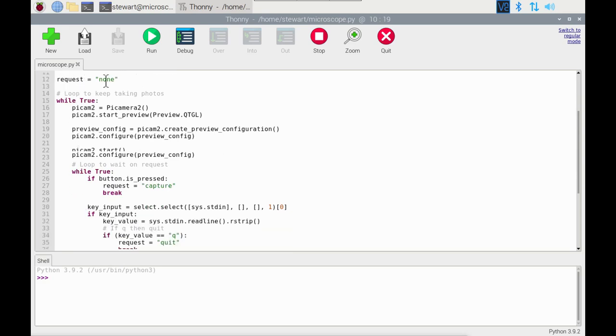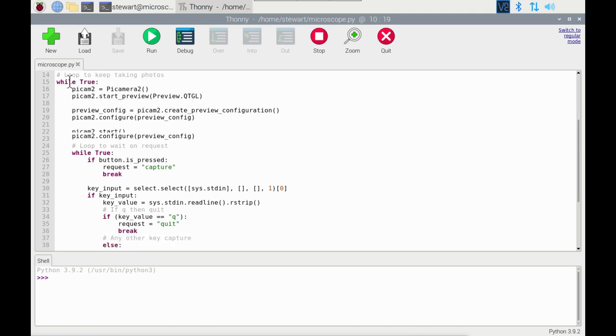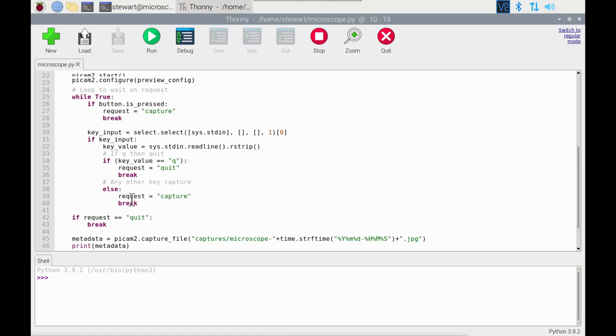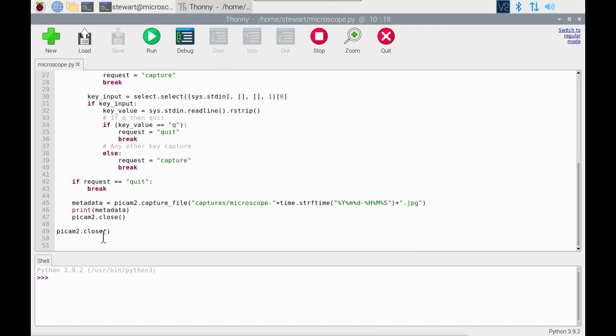Request is just to track whether I requested a capture or to quit the application. It sets up a preview and runs the preview and this is all contained in one big loop so it keeps running. Then there's another internal loop which checks if the button has been pressed. If so, then it says capture and break. Or if a key, the key Q, is pressed which stands for quit, followed by the enter key, then it'll detect that. Or if any other key is pressed which includes just hitting the enter button, then it will assume that's a capture request.